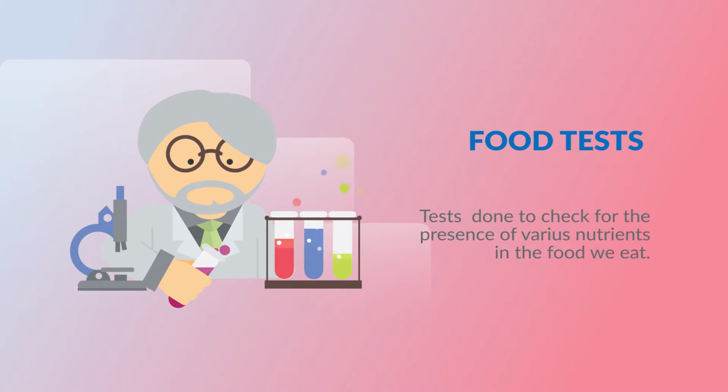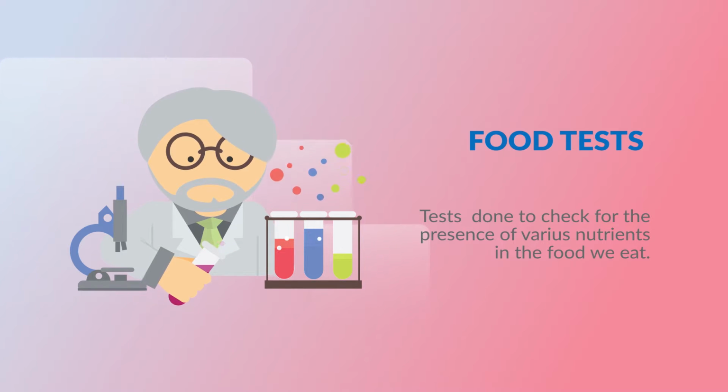In today's lab, we will be doing food tests. These tests are done daily to detect the presence of various substances such as fat, sugars, and proteins in the food we consume. In this lab, however, we will be testing for starch, unsaturated fat, and reducing and non-reducing sugars.